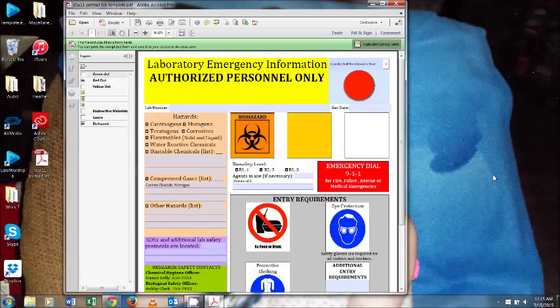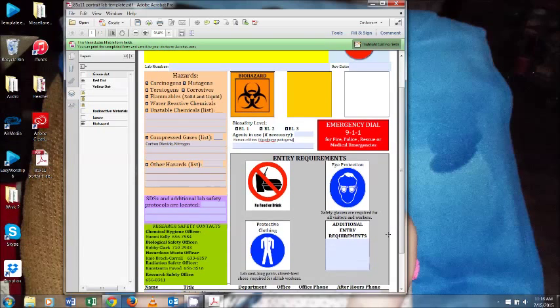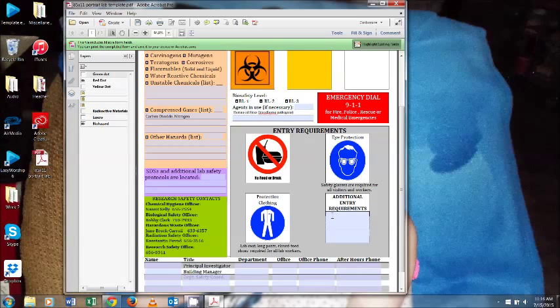If you have special conditions for entry to the lab, you'll need to remember to, one, check biosafety level 2, and then also mention the agent and the reason that there are additional entry requirements into the laboratory in the space given below the selection of the biosafety level. You also need to fill in the additional entry requirements in the appropriate white square shown here.